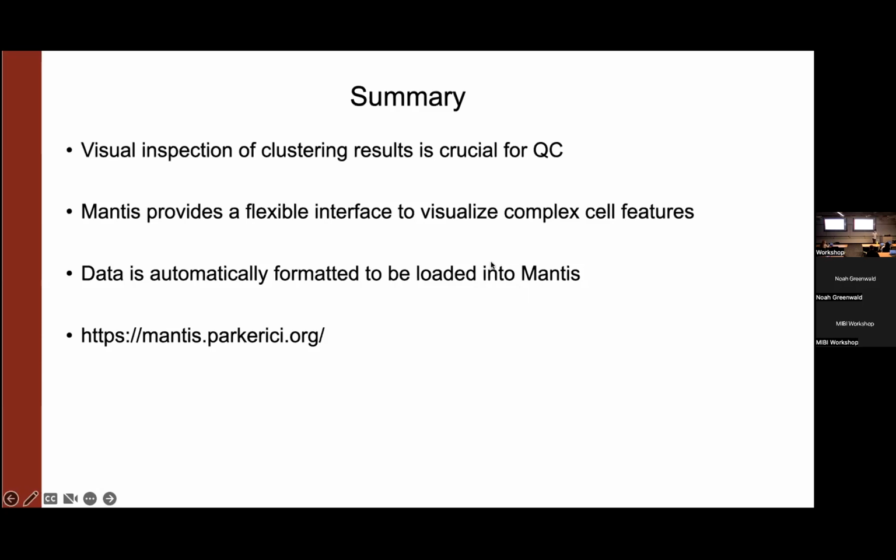I picked 30 of them to do for the segmentation QC, for the pixel clustering QC, for the cell clustering QC, for the marker analysis QC. It was the same 30 for all of them. And I was probably on the more conservative side. I looked at almost every single image for every single step of this.